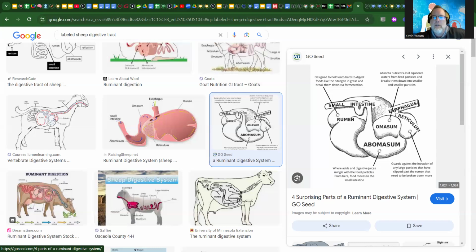And then we leave pretty much the main three and we head into the abomasum, which is a lot like our stomach. So we, of course, have one stomach. Ours is the esophagus into, in essence, the abomasum. So this is where your stomach acids and digestive juices start to blend and mingle. But yeah, this is a hot spot that's basically the beginnings of the end for that upper GI tract, heading now into the small intestines where a lot of the action's going to happen.